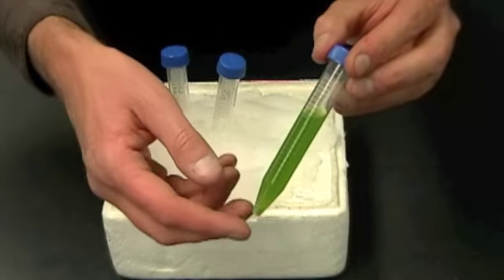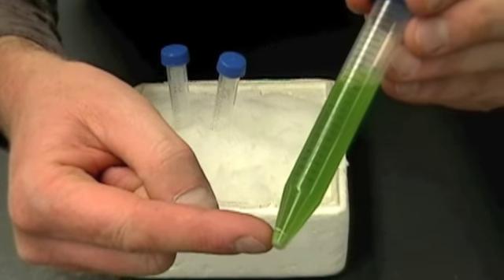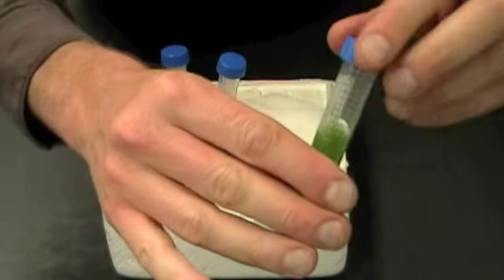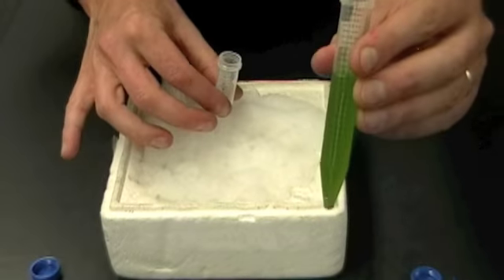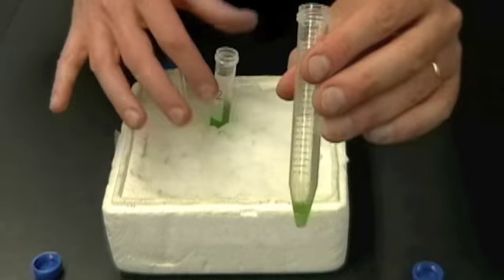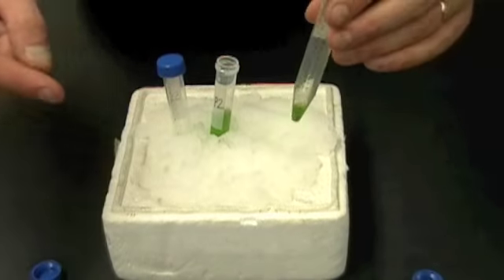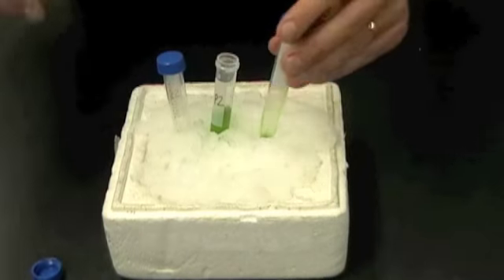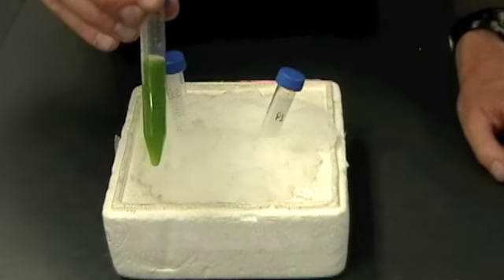Alright, so this is my sample that just came out of the centrifuge, and you can see that some of the material is collected down at the bottom. This is called the pellet, and the liquid up above it is called the supernatant. Now I need to separate those, and that's not very hard to do. That pellet is tight enough that all I need to do is pour off the supernatant into a new tube, and you can see that the pellet is still stuck there. It's okay, I didn't get all of the liquid off, but most of it's off and the pellet is still there. Now, this pellet might contain my chloroplast, so I want to put it on ice right away. And now this supernatant that I've collected goes back into the centrifuge for another spin.